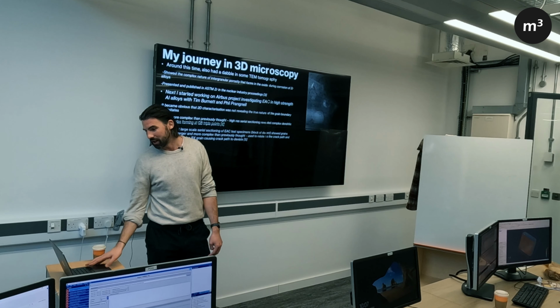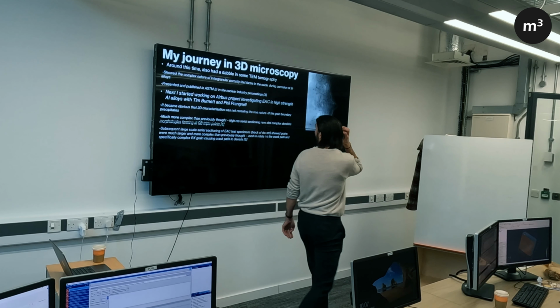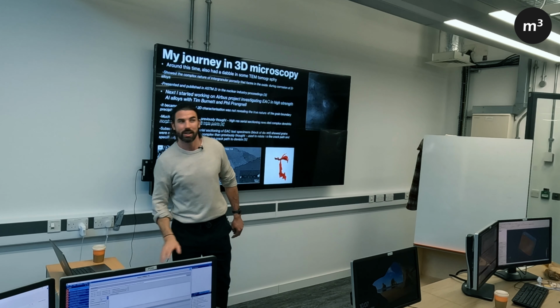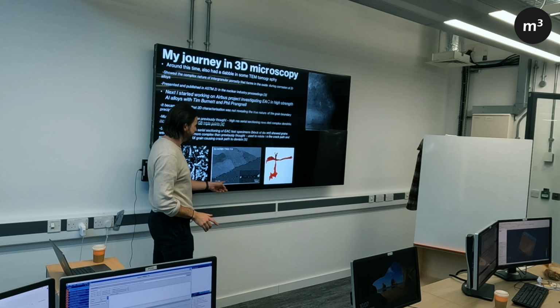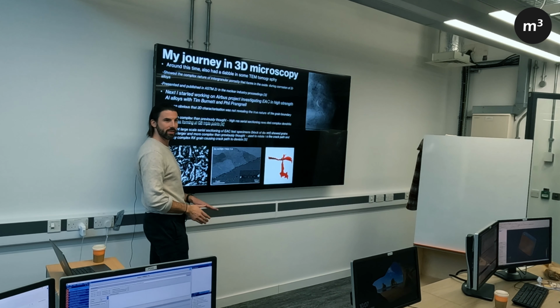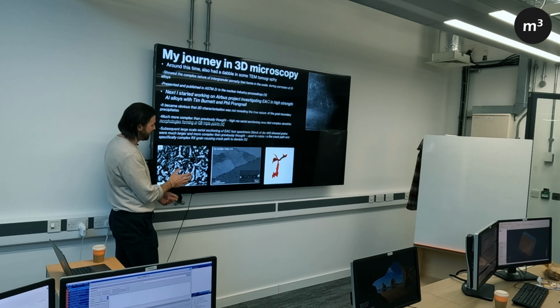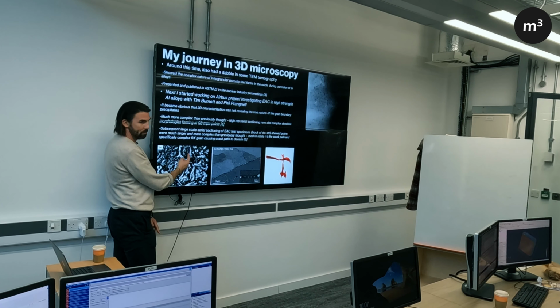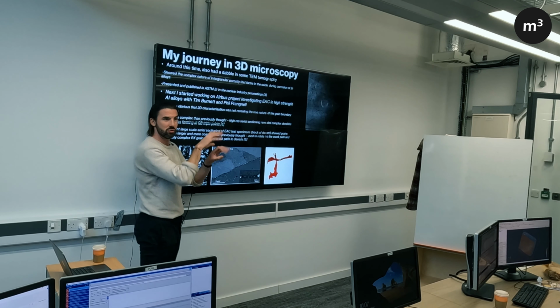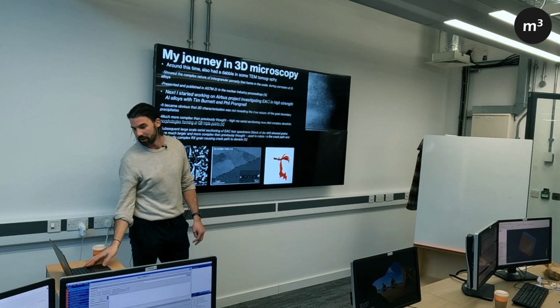And then after that, I started to work on this postdoc project for Airbus, and we were looking at EAC in high-strength aluminium alloys. So yeah, as I touched on before, standard 2D analysis of these precipitates, which is an SEM image here, shows these grain boundary precipitates, and we always thought these were platelet-like discs. And then we cracked them open using a brittle intergranular fracture technique, which opens up the grain boundaries, and we found that they're these butterfly shapes, which no one had seen before. And then when we chopped it up in 3D, we actually found that they form these mad dendritic structures at triple points, which we found are really important for EAC behaviour.